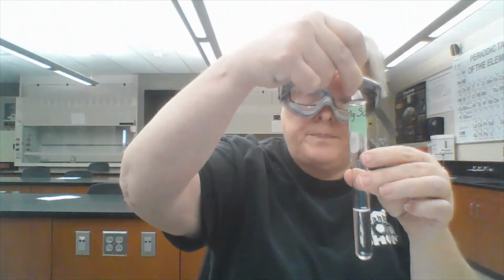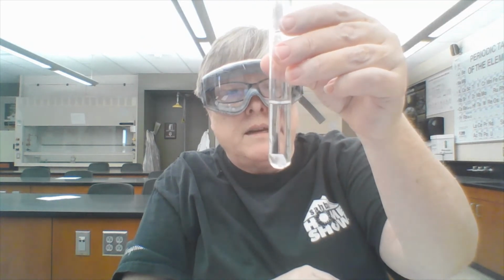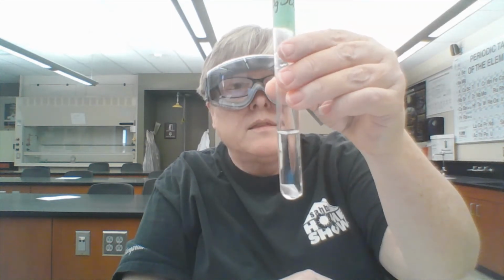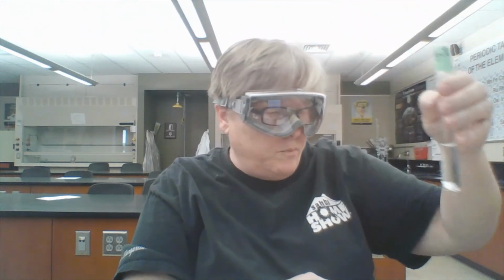This is test tube number 4. It has magnesium sulfate in it, and I'm going to put a nice shiny little piece of zinc in there. I don't see anything right away. Perhaps there are a few bubbles on the zinc strip. We'll have to come back and look at that later.